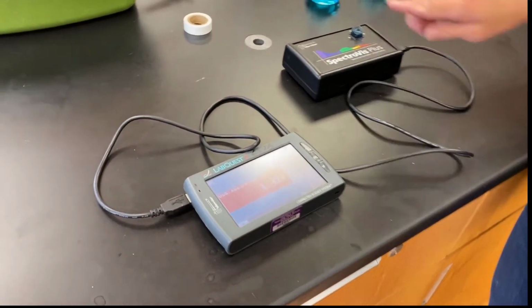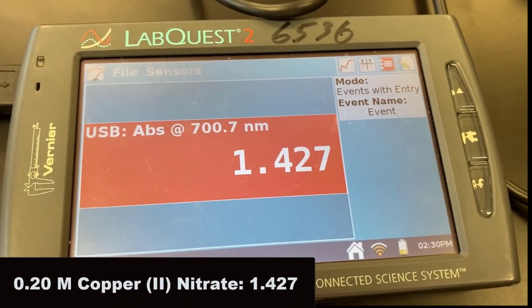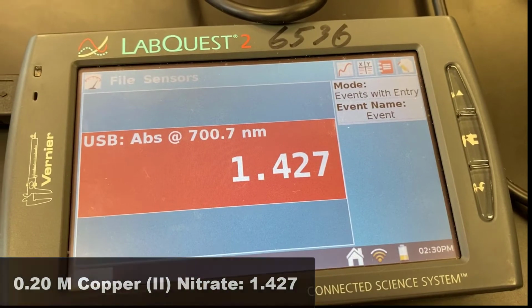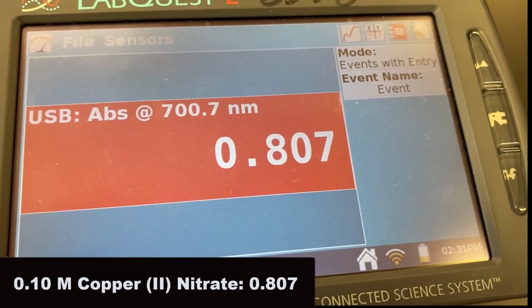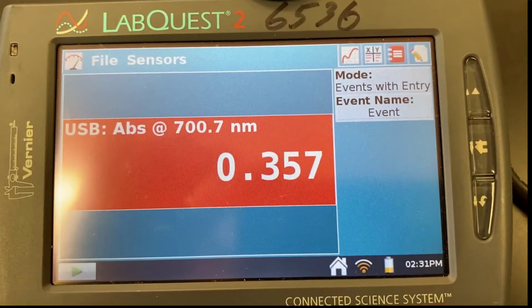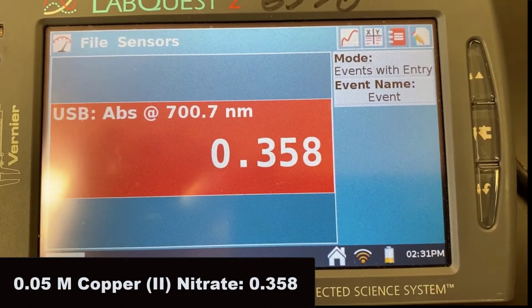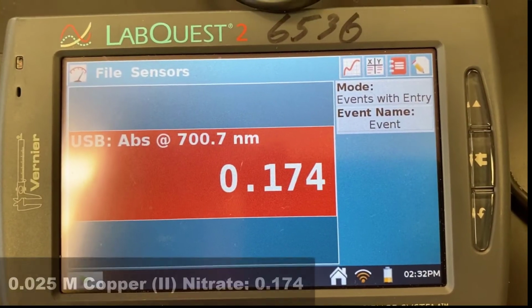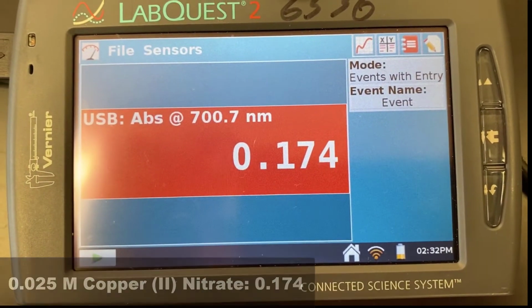I have 0.2 in here, and the absorption of 0.2 is 1.427. 0.1 molar, and this is reading 0.807. And this is the 0.05 molar solution, reading 0.358. And the 0.025 molar solution is reading 0.174.